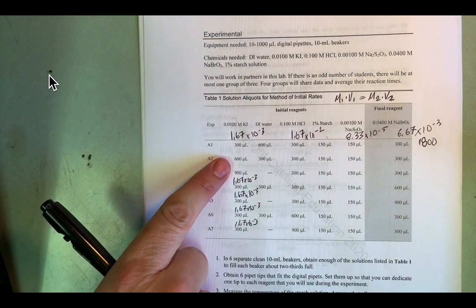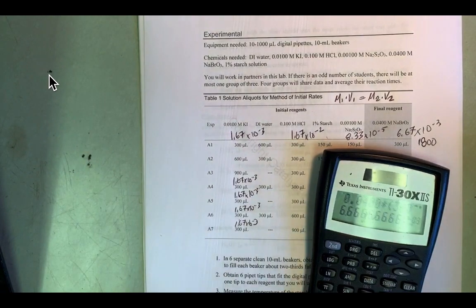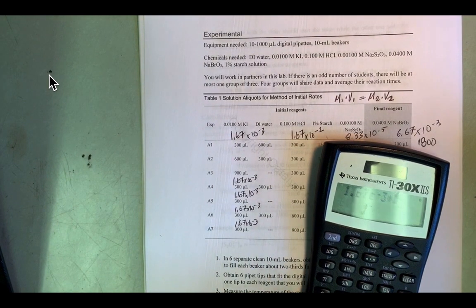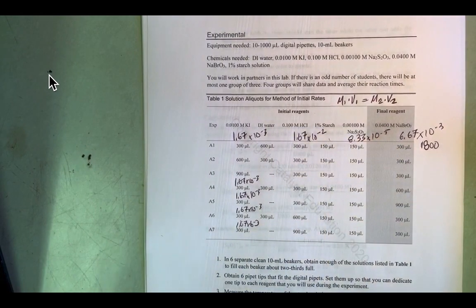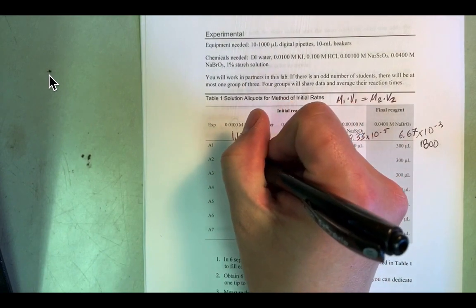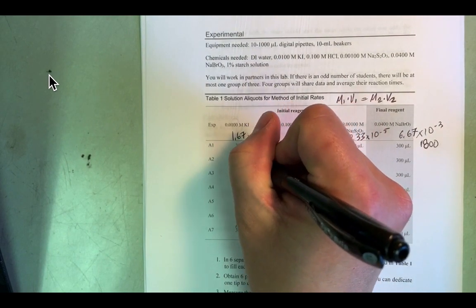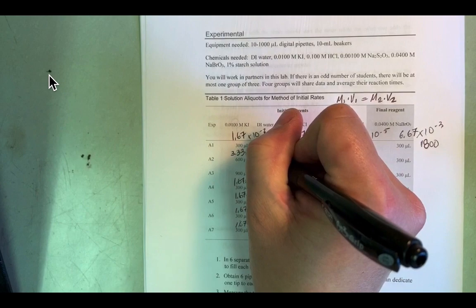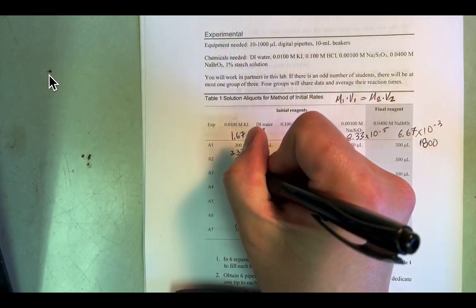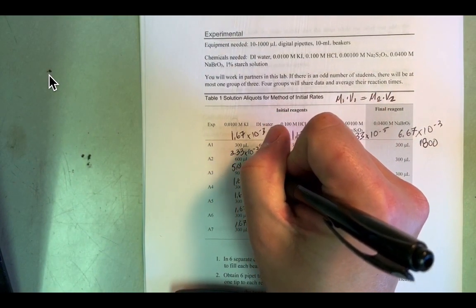This is double the amount. So if I just take my 1.67 times 10 to the minus 3 and double it, 3.33 times 10 to the minus 3. Or triple it, 5.01 times 10 to the minus 3.